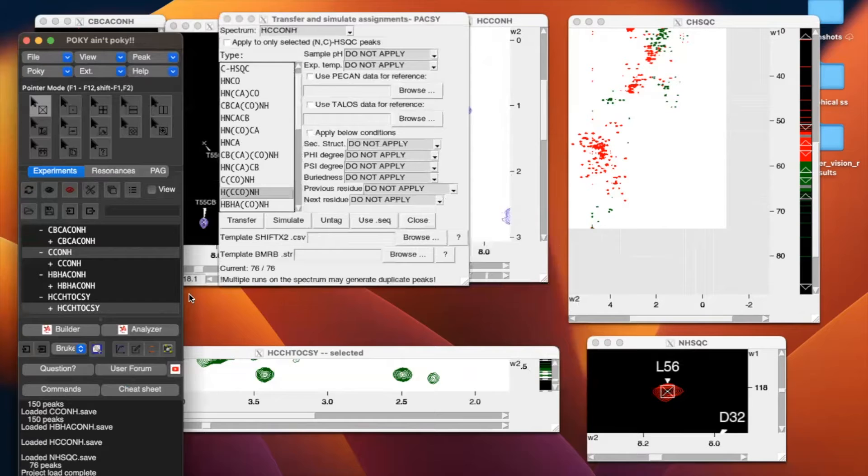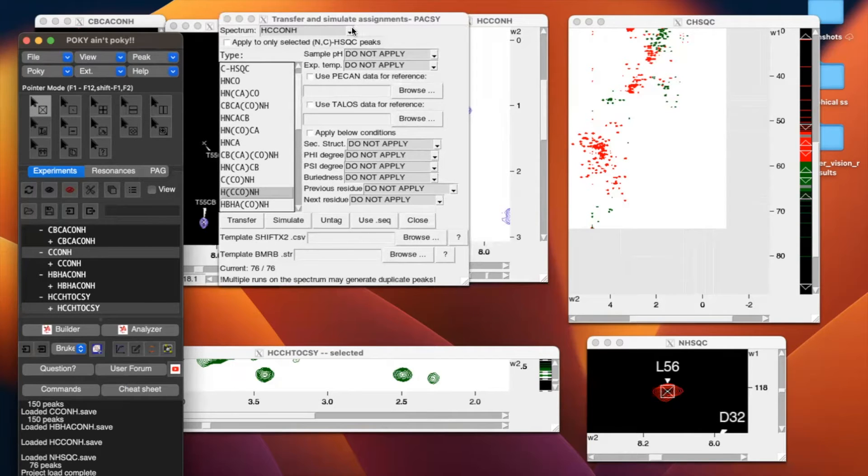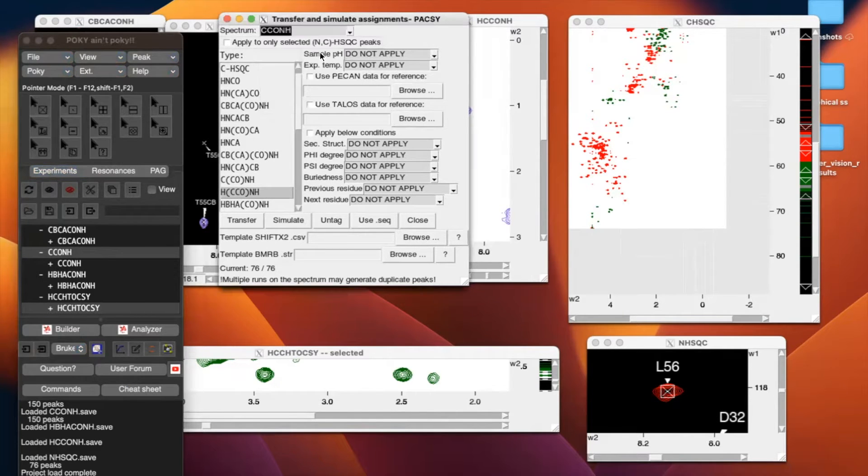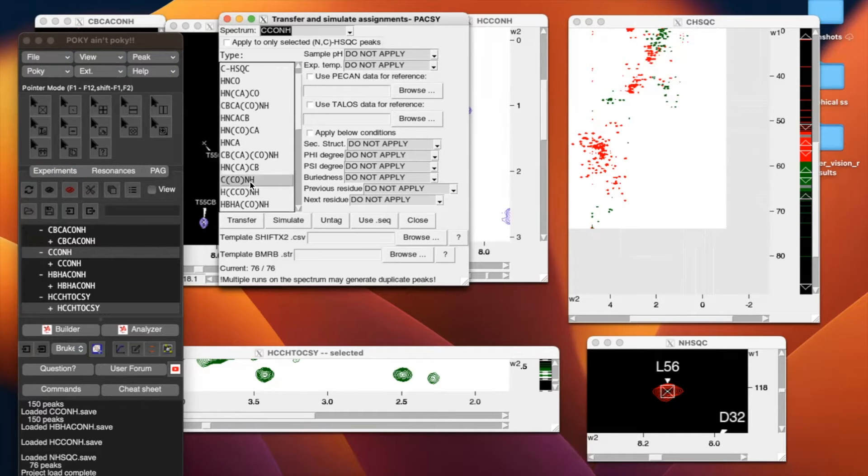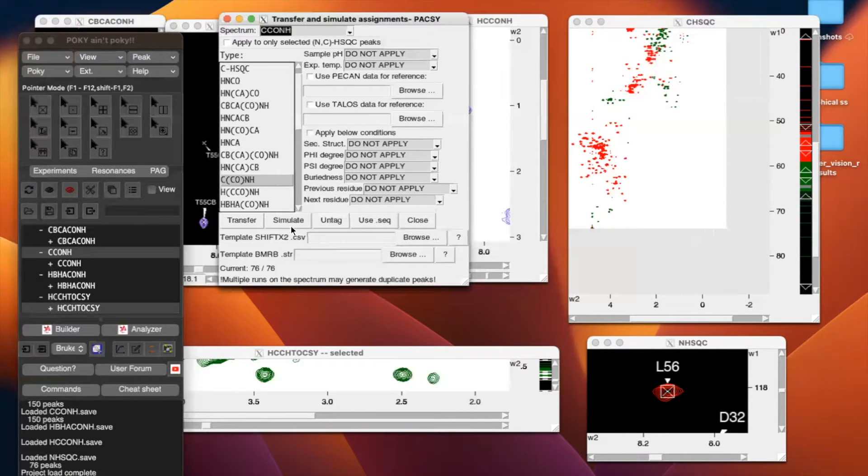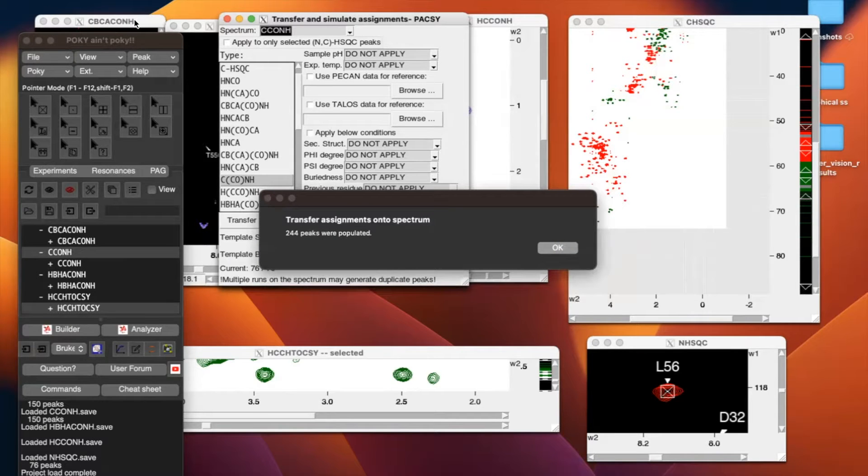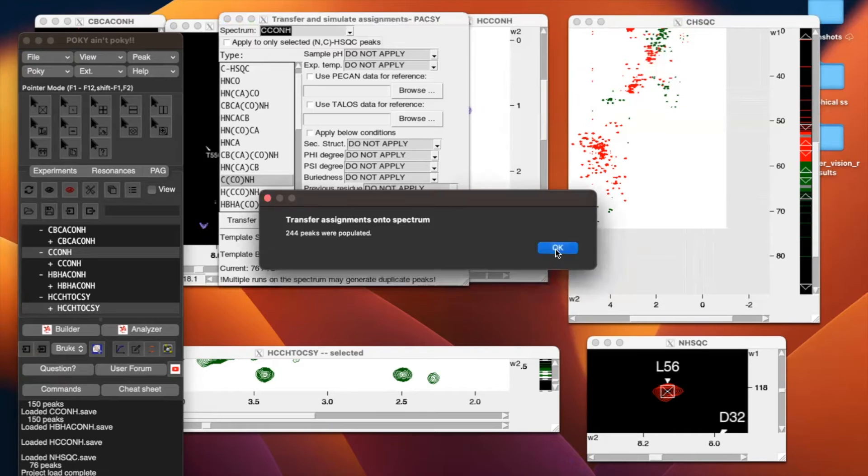From here, we are going to enter the spectrum we want to transfer to, so CCONH. The type of experiment it is, CCONH, and then simulate. We are going to transfer known assignments from previous data, from that CVCA-CNOH, and simulate unknown assignments.